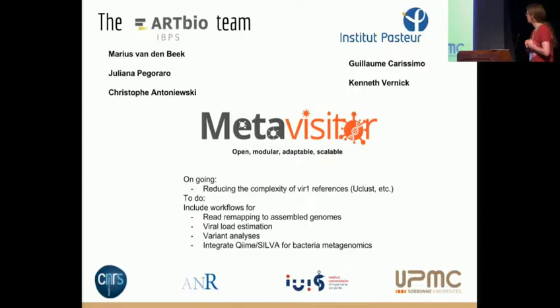And I think this can be adapted to things that are outside of the viral field. We can think about looking at how many reads we have actually found and see whether this is different across different samples. We might go to bacterial metagenomics, but I see that there are already quite a few good things out there that have also been presented yesterday and in the training. So, thank you.